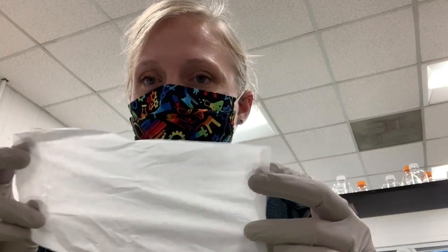Okay. So I have all of my tubes, I have the lids up. As we mentioned, you don't want RNases in your RNA. So what I do is I just take one of these chem wipes and drape it over the samples. This is just to keep dust from falling into the samples while they're drying. And I'm going to set a timer for 5 minutes. This will allow any remaining ethanol to evaporate. What's left will be our purified RNA.